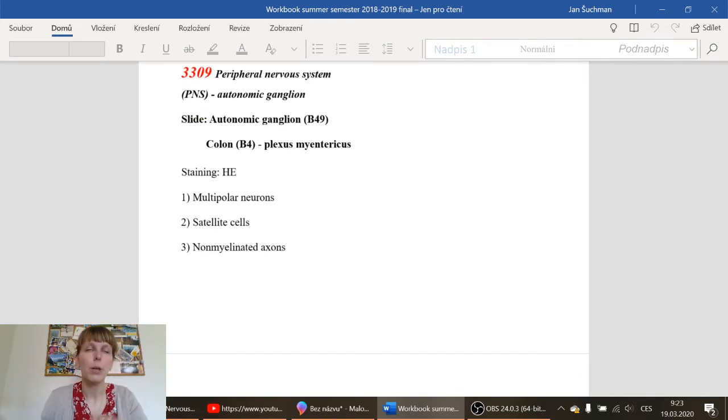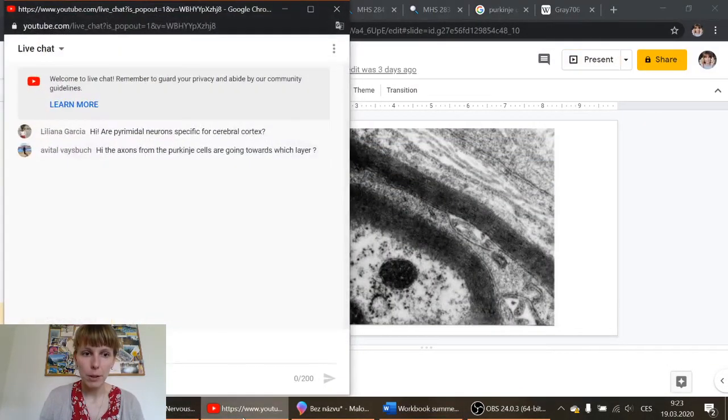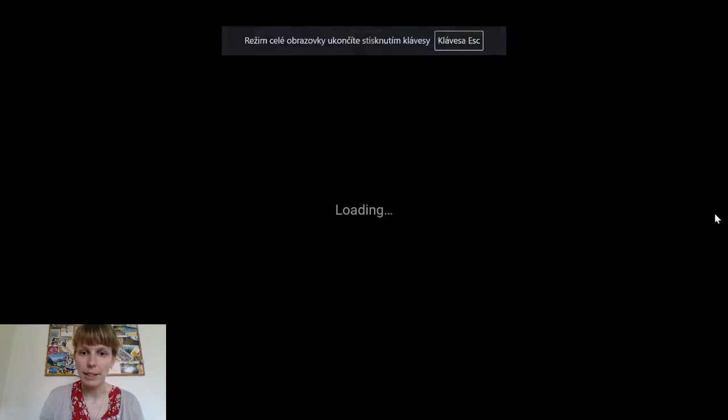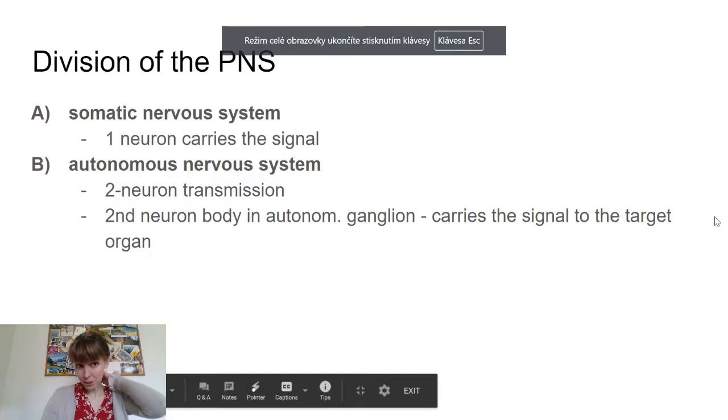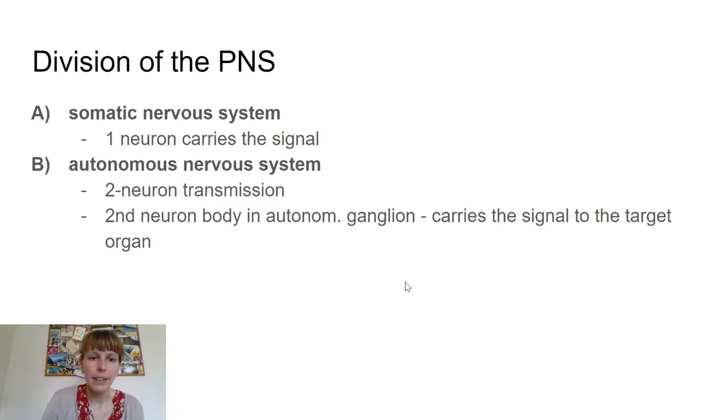We talked about the peripheral nerves, efferent together, being carried around the body inside the sheaths of connective tissue. But I told you that we also have some bodies of neurons inside the periphery. These will be the ganglia. And oh, one more thing, sorry.